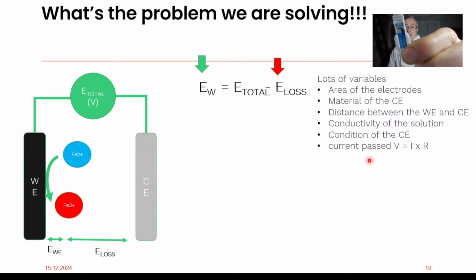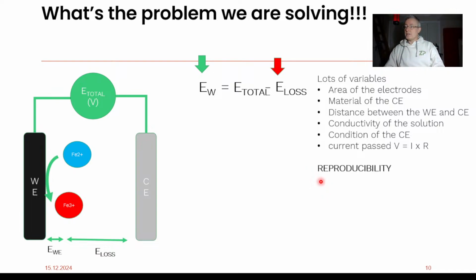Some of the historical reasons for having a potentiostat were because potentiostats predate screen printed electrodes and a lot of this low current electroanalytical chemistry that we're now doing. Out of interest, potentiostats, I think, first appeared in the 40s, and I think they were actually invented at Leicester University in the UK. I'm still trying to figure it out, but over time I will understand it a bit better.